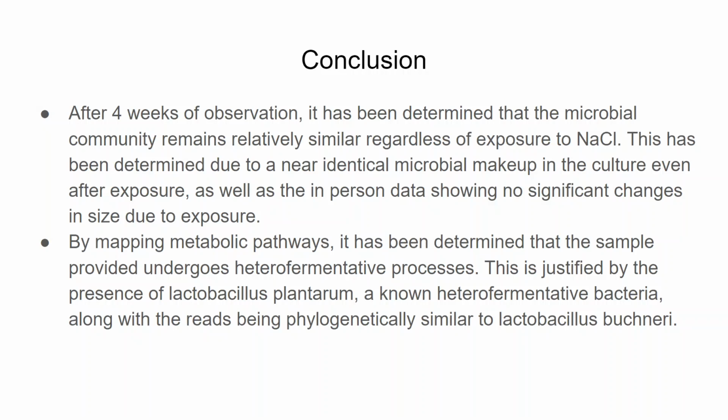And by mapping metabolic pathways and observing the phylogenomic tree, it has been determined that the sample provided undergoes heterofermentative processes. This is also justified by the primary presence of Lactobacillus plantarum, a known heterofermentative bacteria. The reads were phylogenetically similar to Lactobacillus buchneri and also heterofermentative bacteria.